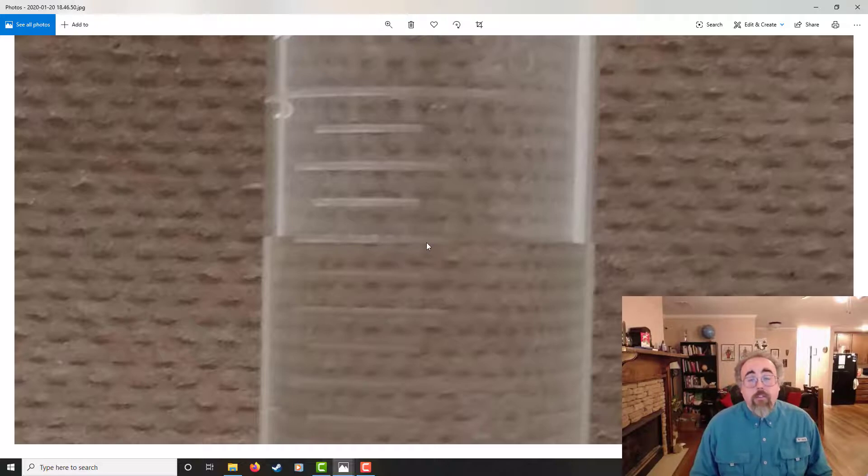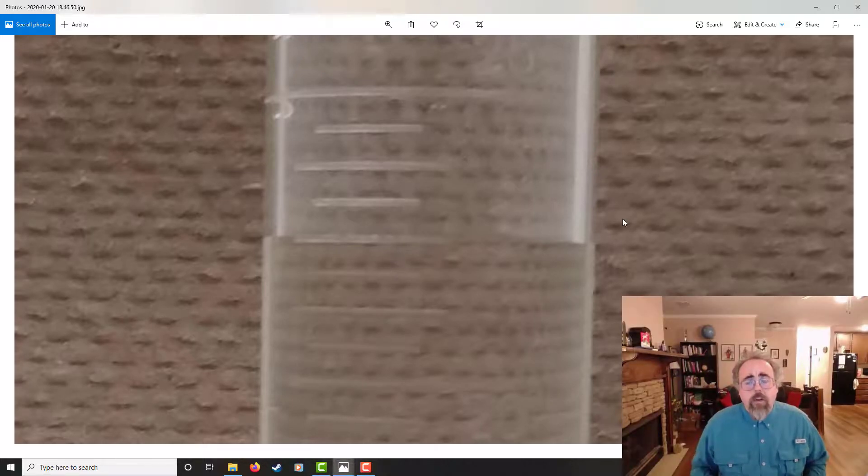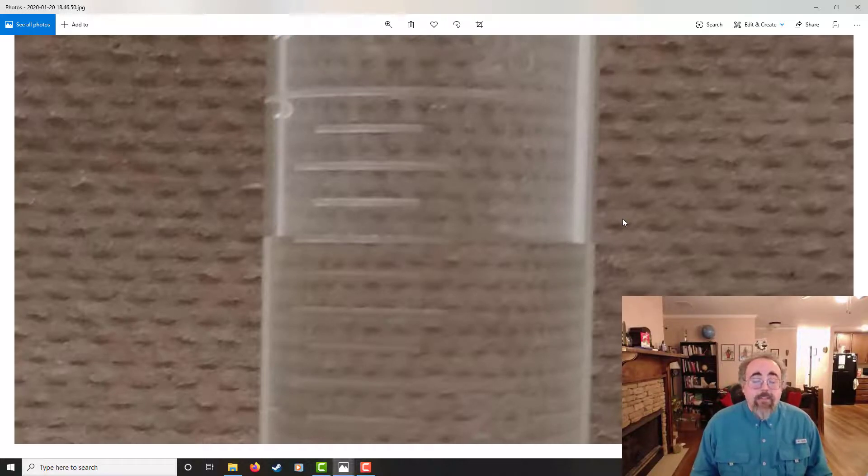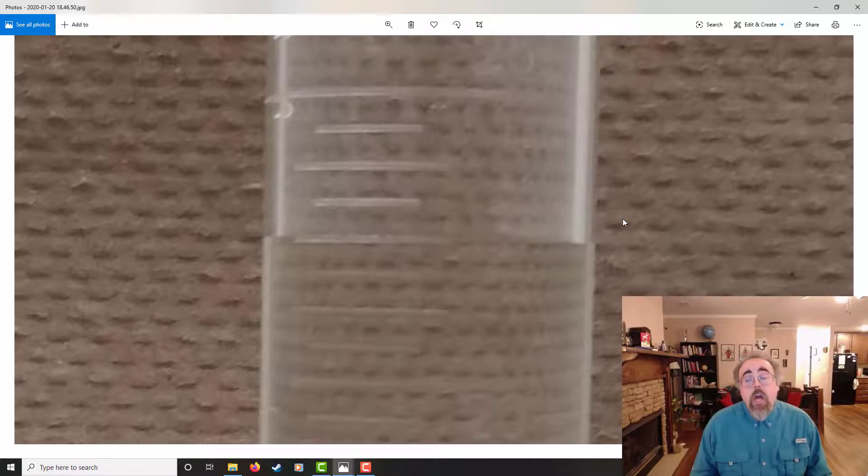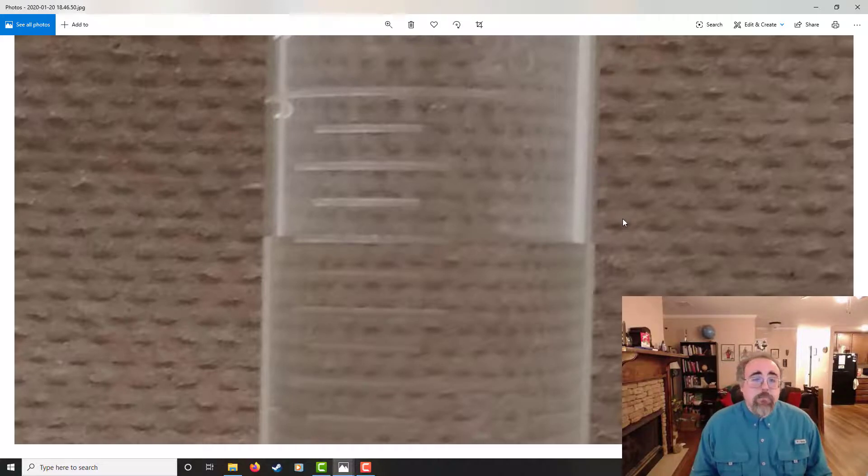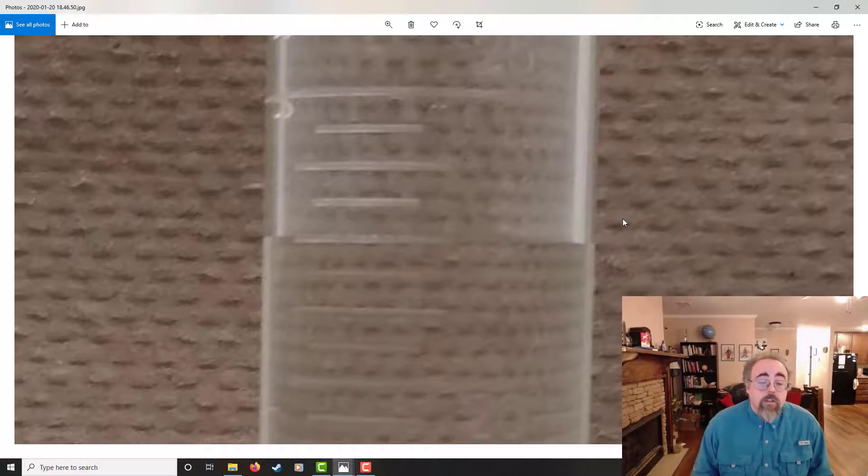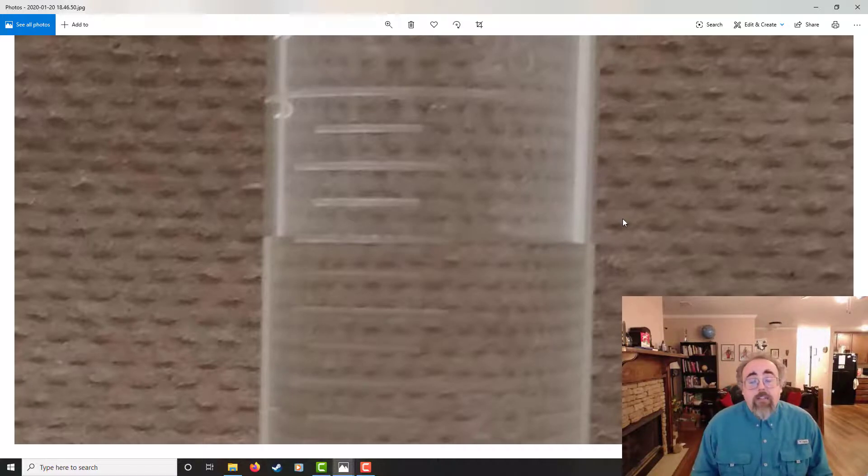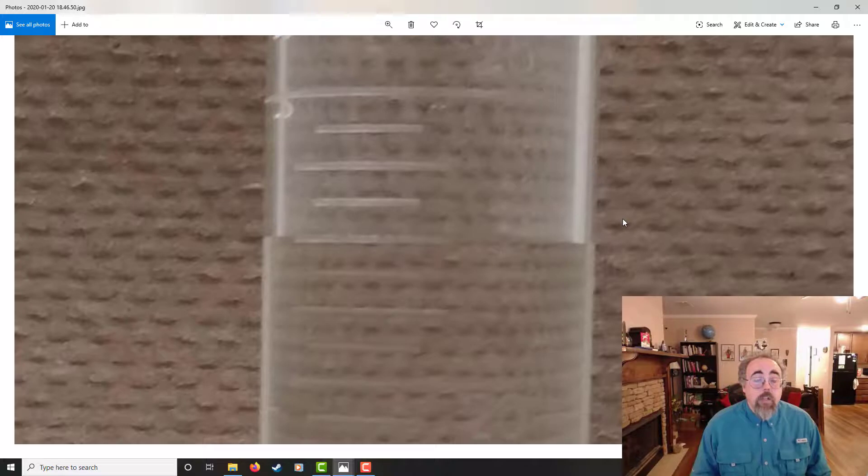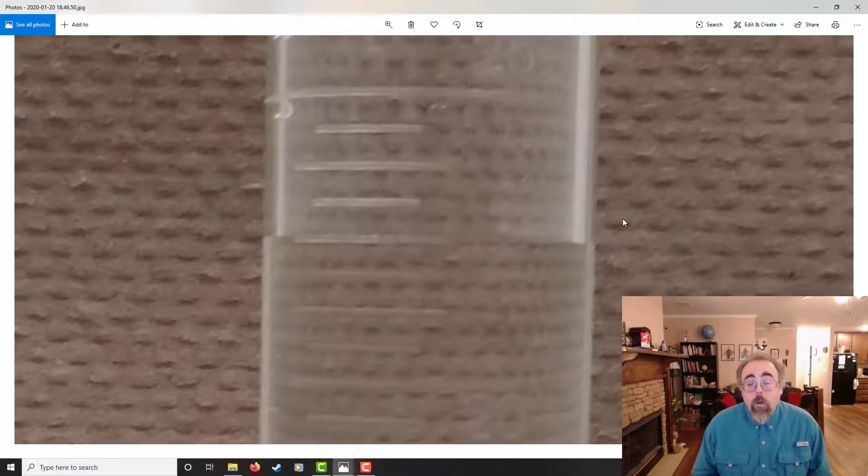So yeah, different graduated cylinder. Choice of what you make them out of or which one you use, plastic versus glass. Obviously, plastic is not going to break if you drop it. You see those a lot in teaching labs because some people drop stuff. They're cheaper, but they're a little harder to read, and some solvents will just kind of dissolve the graduated cylinder, which is a problem. So it does depend on what you're working with, how much you're wanting to spend. They are a little bit cheaper. This is just injected mold in, but it works fine.